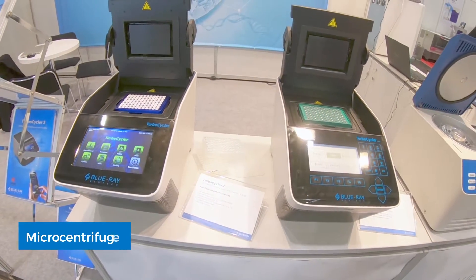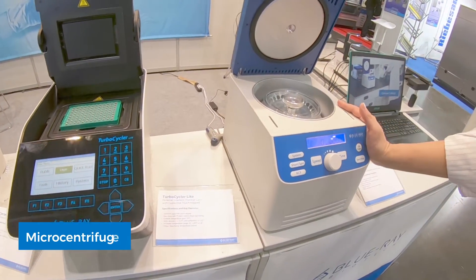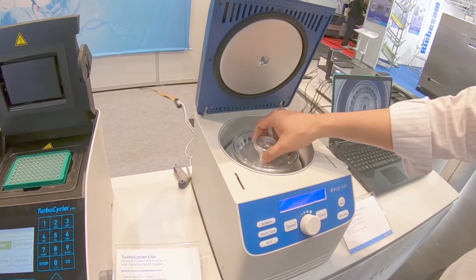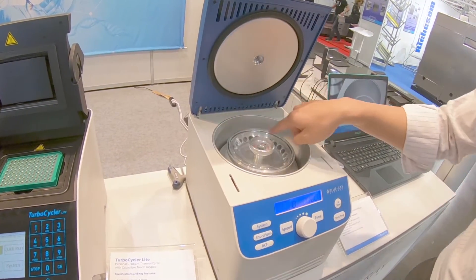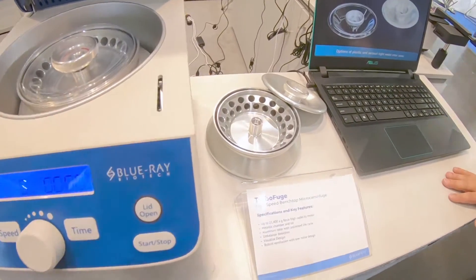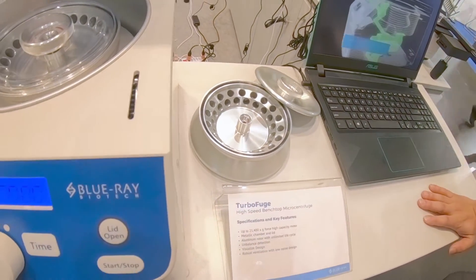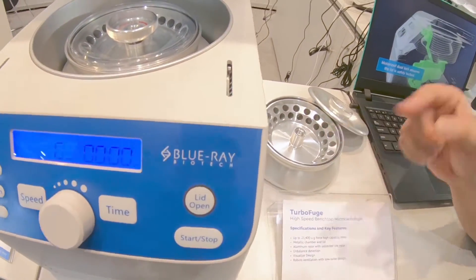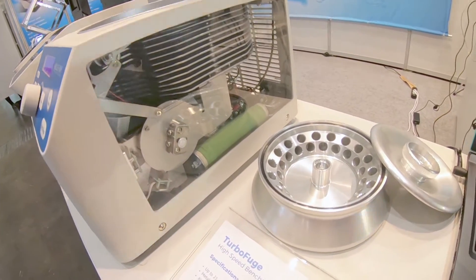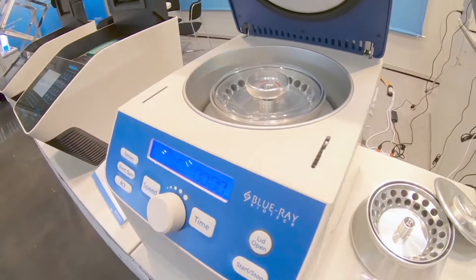The third part is the centrifuge. As you see here, this is a micro centrifuge machine and it comes with two kinds of rotor — one for 24 and the other for 36. The major highlight of this machine is that safety is our first priority. You can see we have an unbalanced detector inside with dual lock for safety.